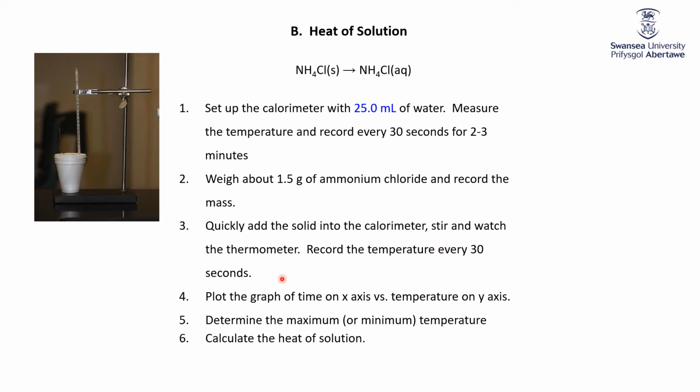Then for our data analysis, we need to plot a graph. And the whole idea of plotting that graph is that it is the best way to get the temperature change. We know the initial temperature. We can use graphing techniques in order to get the maximum or minimum temperature. And then we use that to get the heat of solution.